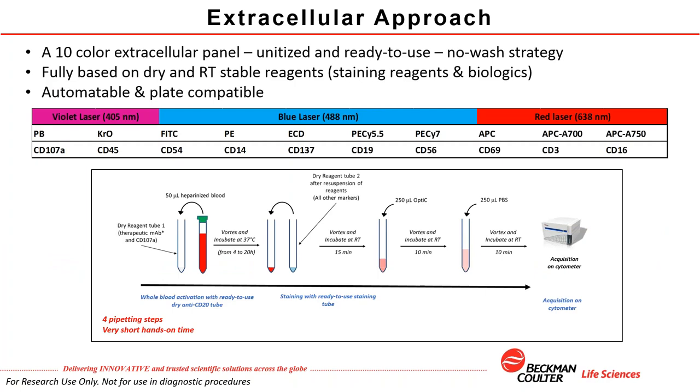This is the workflow that has been optimized for the extracellular approach. As you can see, as in the case of the basophil activation testing, this is a pretty simple workflow, and this was really important for us to assess our ability to perform a really simple workflow in that case as well, because streamlining and 96-well plate transposition are all topics of interest to us when we're dealing with this topic.